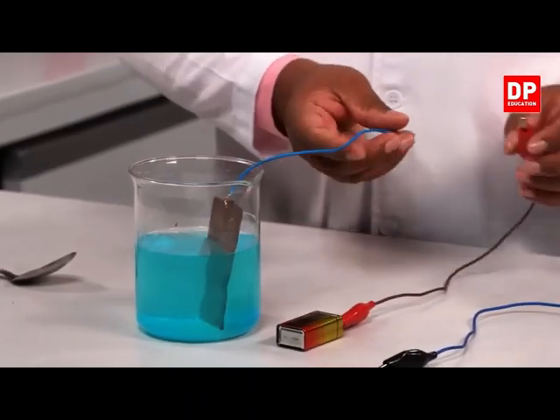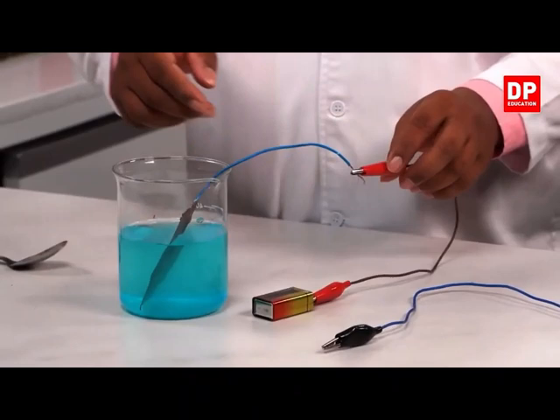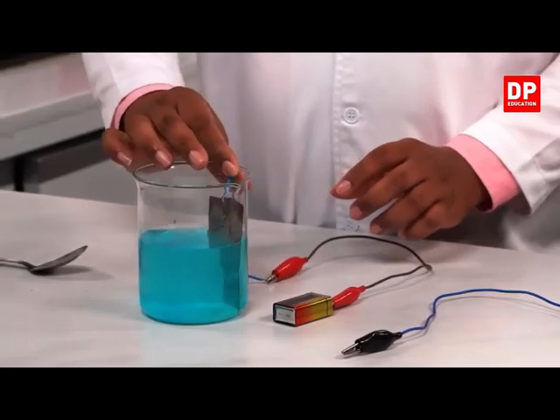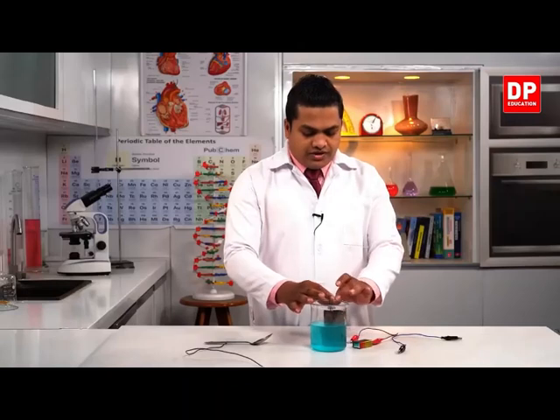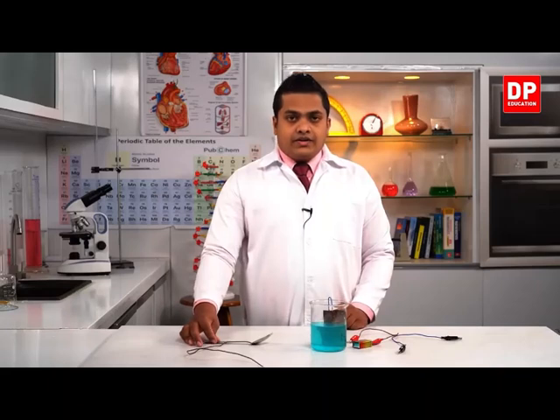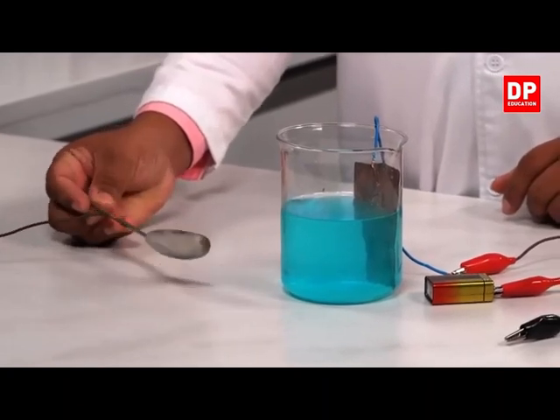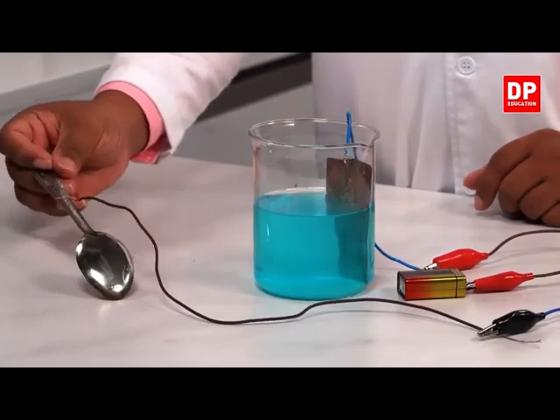Then let's connect it with the positive terminal of the dry cell, the red color one. My dear children, it's important not to touch it with the negative terminal, right? The negative terminal is now my spoon here. So I'm going to insert it. You can see there are no other metals plated on the spoon.